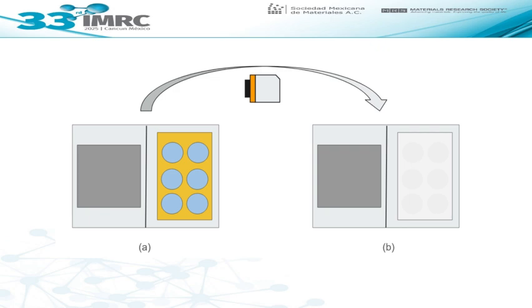Now, in the left part of the image, we have a diagram of the scene that our camera sees, but in visible light. Our camera doesn't retain the information of the visible light.